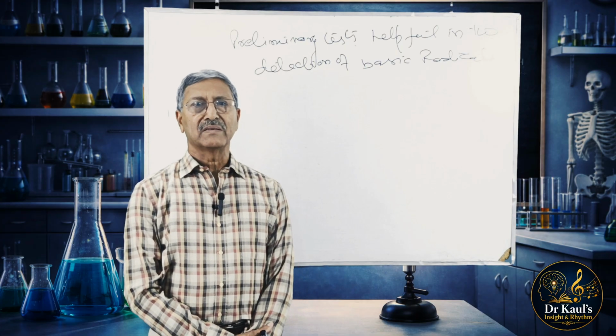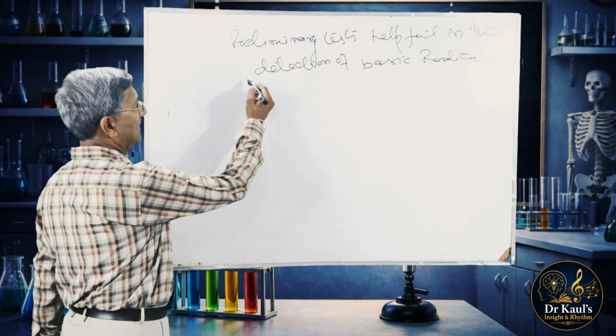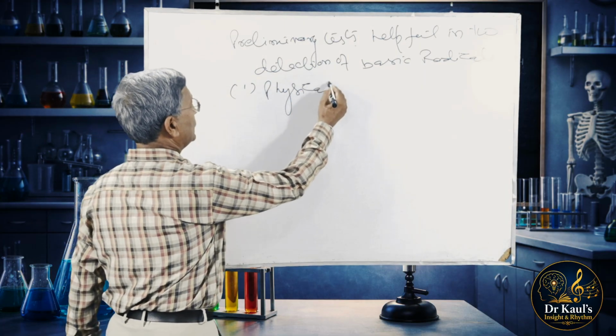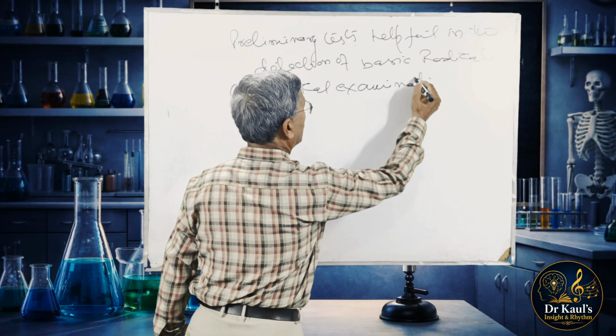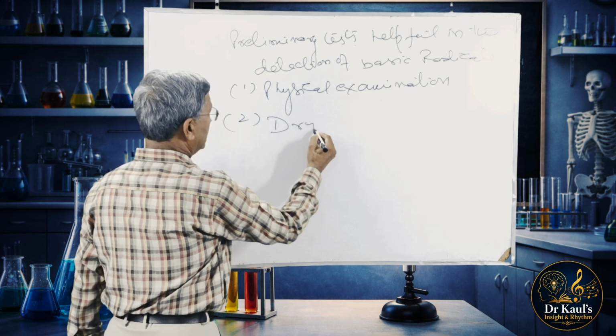Now, in this group of tests, we come across number one, physical examination. Number two, dry heating test.